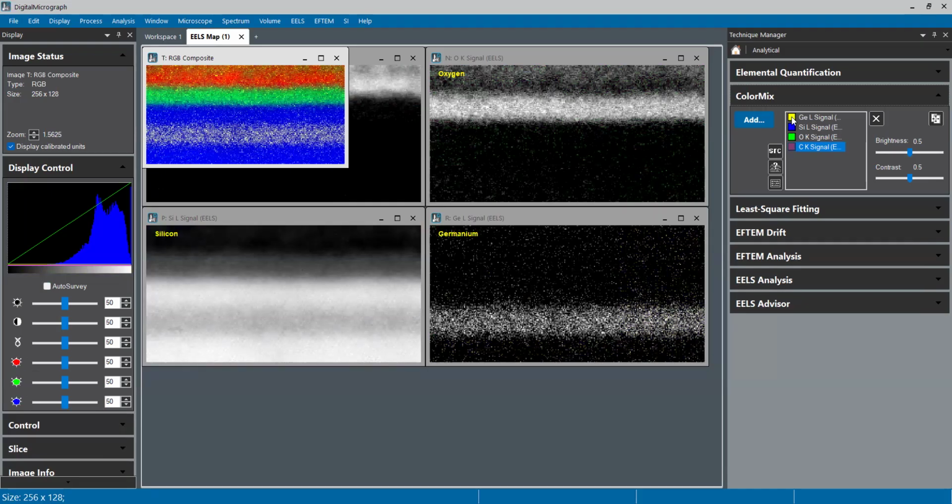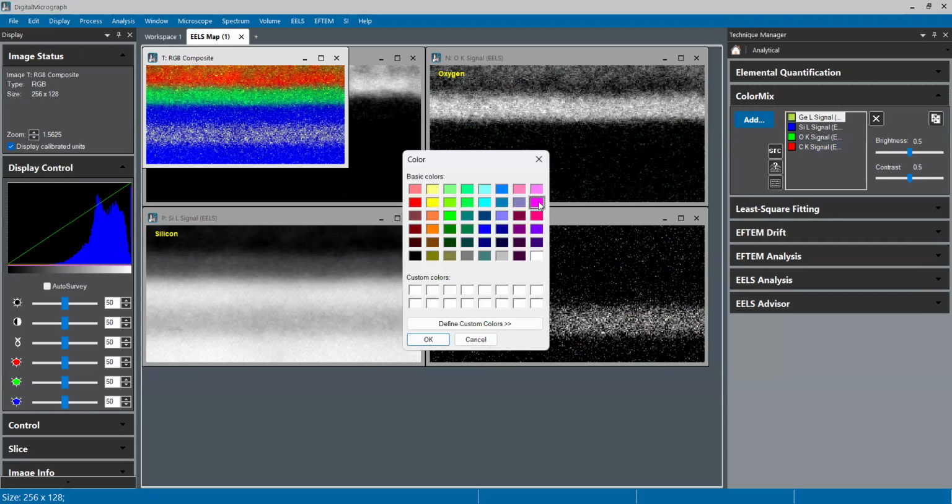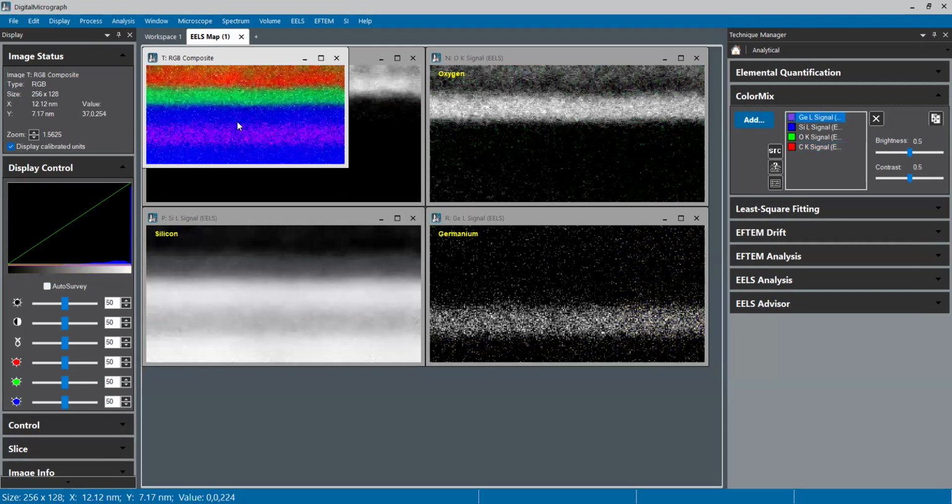So I'm actually going to leave this on, what I had been doing was putting this on magenta. It looks okay now, but I know when we do it later for the atomic, it doesn't work quite as well on magenta, but we'll leave it on magenta here for the time being. Well, since we need to do the yellow before, no, I want to do that actually, and I'll show why in a second.